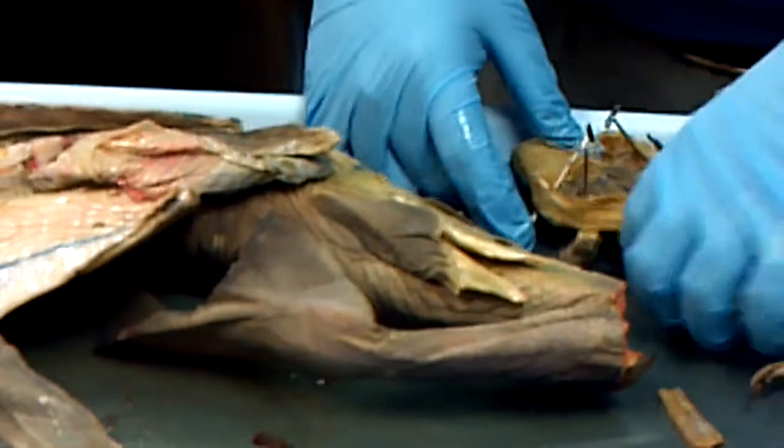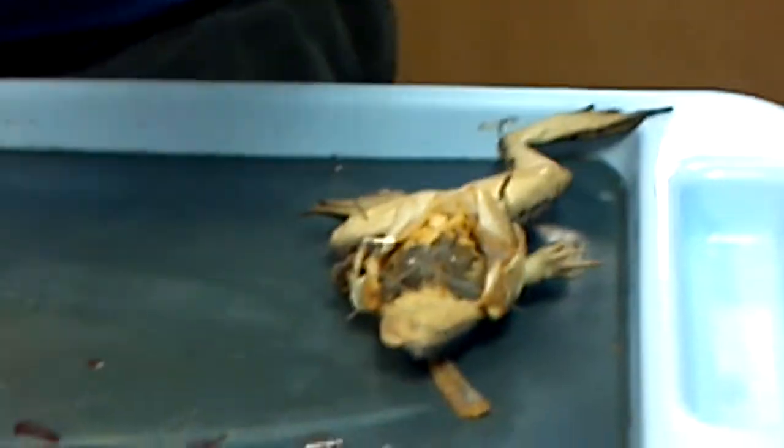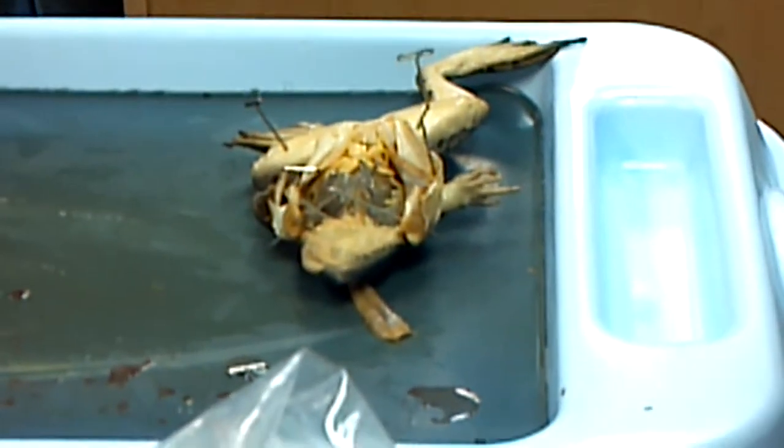Yeah, that's a shark. I'm going to move the shark out of the way. Tuck his liver back in — don't want that lost.